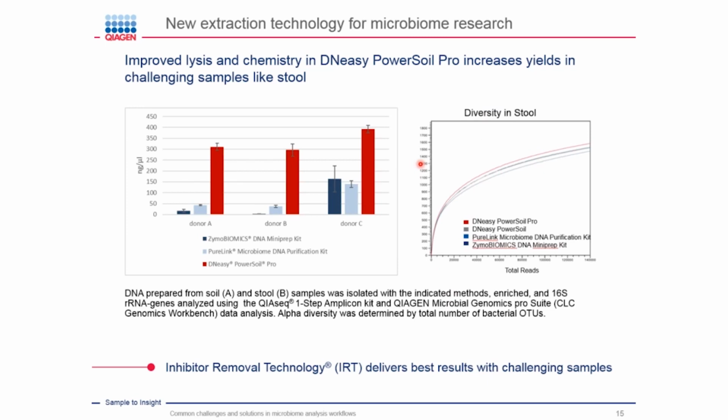So this is the first step you can go to certify that your microbiome sequencing approaches give you the best picture of your real microbiome sample. Think about what's your sample, think about the appropriate sample extraction kit, and this is already giving you a good basis to start with.